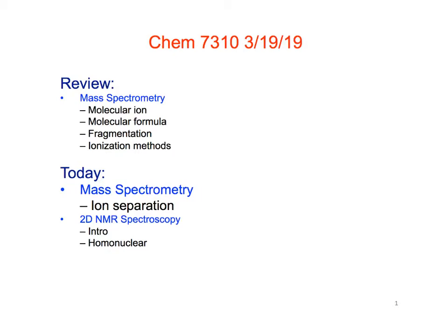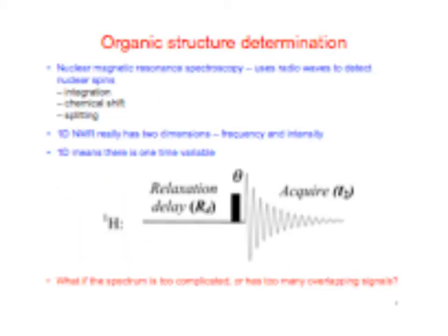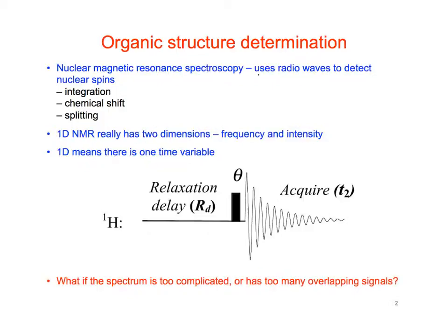All right, and our second thing to talk about today is to start into our introduction to two-dimensional NMR, okay? So we've already learned about NMR, that NMR uses radio waves to detect nuclear spins, right?